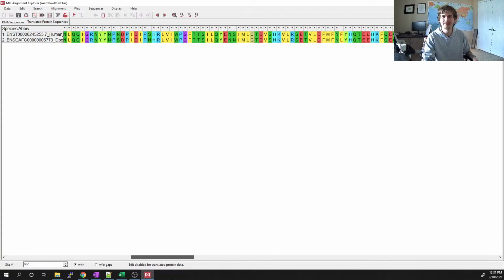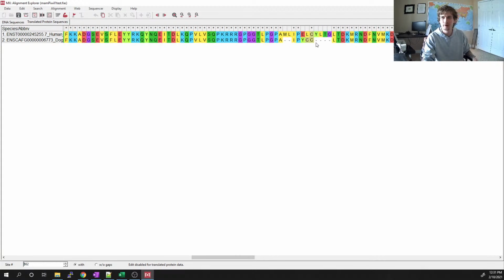And so whenever we see the amino acid sequence, we can see those gaps are there just for the amino acid. They're gapping the codons and the amino acids to produce our alignment. Normally, under a better situation, I would get two sequences that would align okay, but we'd have gaps of single bases or two bases, and it's going to disrupt our reading frame, and it'll look awful whenever we translate to protein.